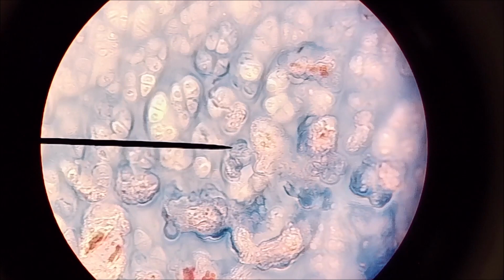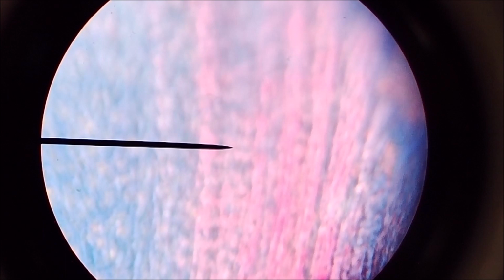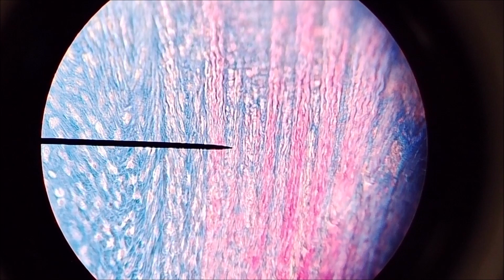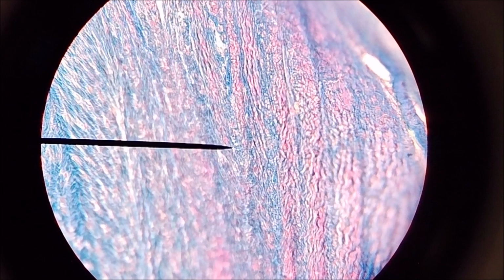But the key difference, the part that I want you to be familiar with, is over here. You see this? Look at the rings of fiber. Can you tell they're in rings? Right? Little pieces. These are bands of collagen, thick bands of collagen that surround this tissue. And by providing this structural support, it makes the gooey portion in the middle kind of act like a rubber ball, and then this fibrous outer network holds the whole thing together. Pretty neat cartilage.